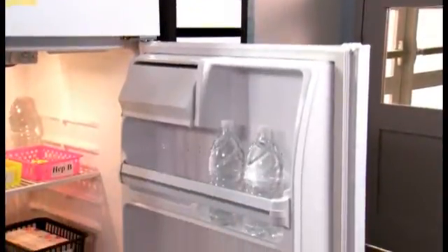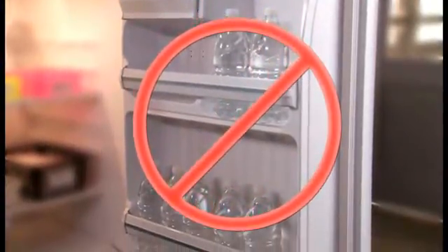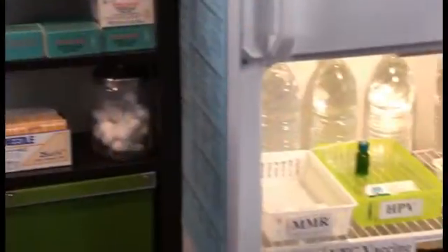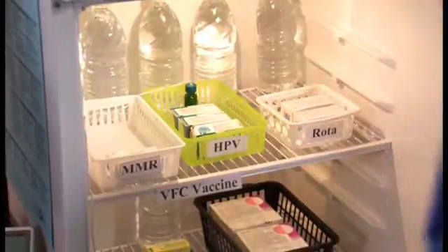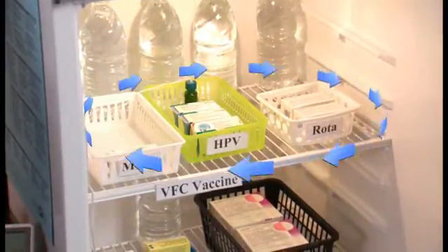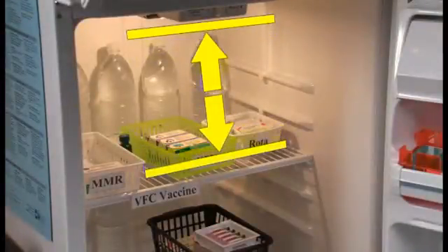Inside the unit, be aware that you should never store vaccines in the door of the refrigerator or freezer, as the temperature in the door is not stable. Instead, vaccines should be stored in open containers in the center of the refrigerator, away from the walls and floor of the unit to allow air to circulate freely. Also be sure the top shelf is not positioned too close to the freezer vents, which could expose your vaccine to freezing temperatures.